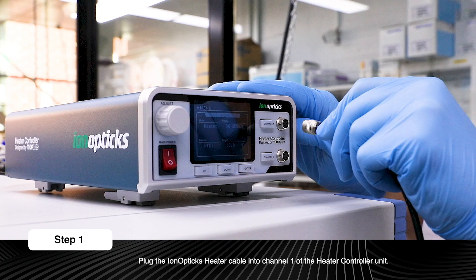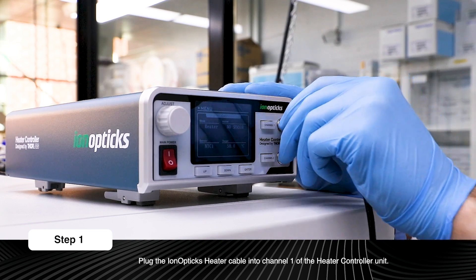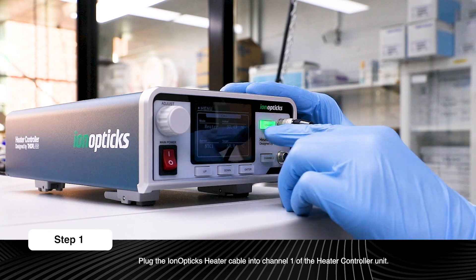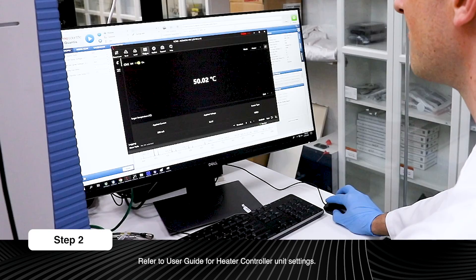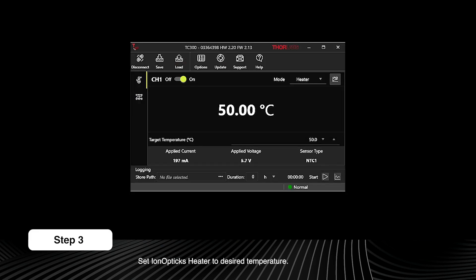Plug the iron optics heater cable into channel 1 of the heater controller unit. Ensure settings on the heater controller unit match the settings outlined in the user guide. Set the iron optics heater to the desired temperature.